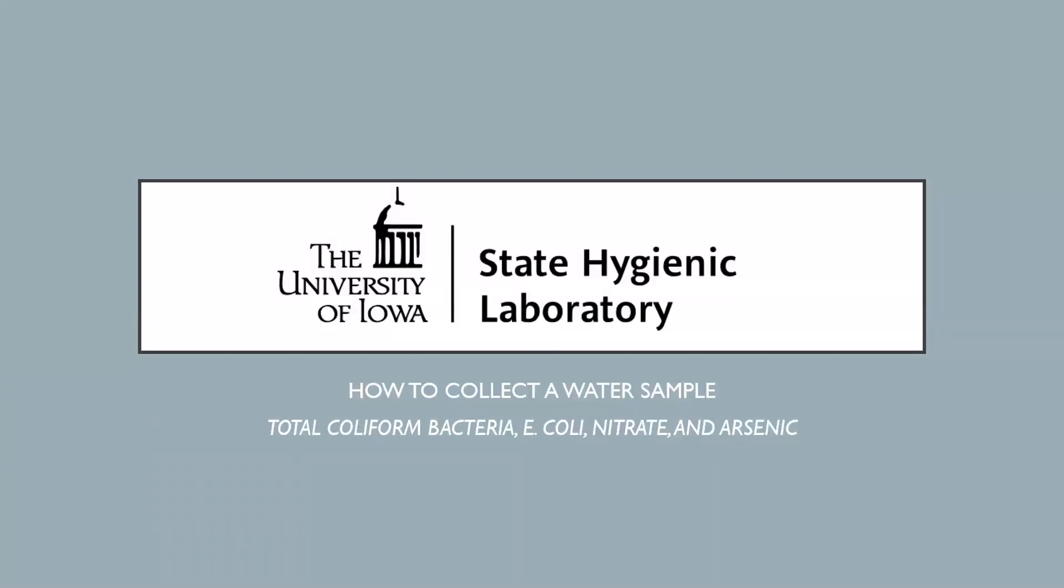Hi. On behalf of the State Hygienic Laboratory at the University of Iowa, today I will be showing you how to collect a drinking water sample and have it tested for bacteria, nitrate, and arsenic.